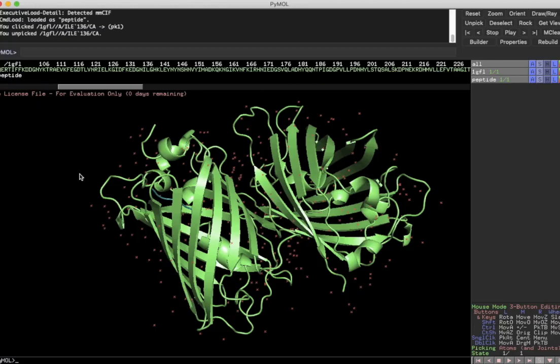So in this video, we're going to move into a more advanced area of molecular modeling. In the introductory videos, we covered moving the models around, selecting things, doing mutations at specific residue sites, and building a peptide. In this advanced series, we're going to be looking at how we modify proteins at a broader scale, and in this video in particular, how we connect the linker or the peptide that we made in the prior exercises to another protein, such as this GFP.